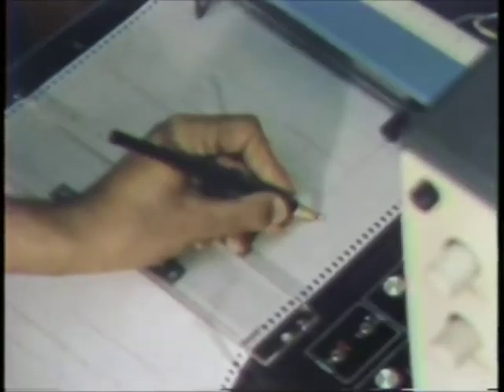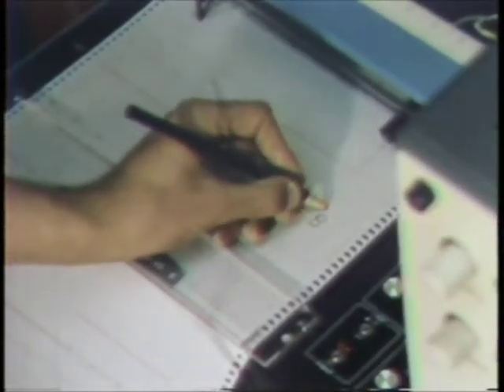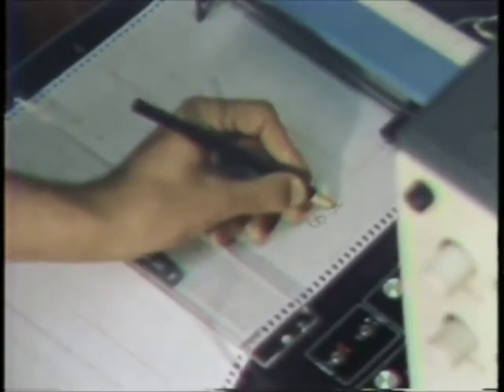While a gas chromatograph can separate components of a mixture, it cannot positively identify substances. We need a mass spectrometer to do that. The theory of mass spectroscopy can be illustrated when a paper clip is dropped through a magnetic field. Animation shows how the paper clip is deflected by the magnetic field.